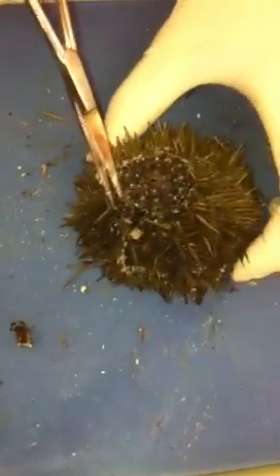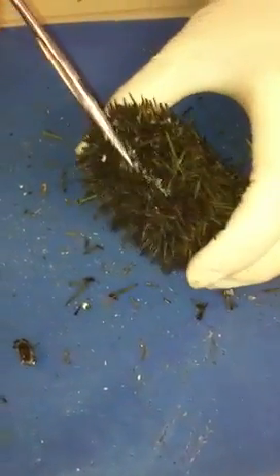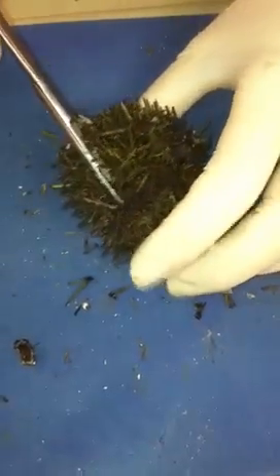When you're done with that, you're going to make an incision down the side of the sea urchin and continue your cutting until you've made two hemispheres.